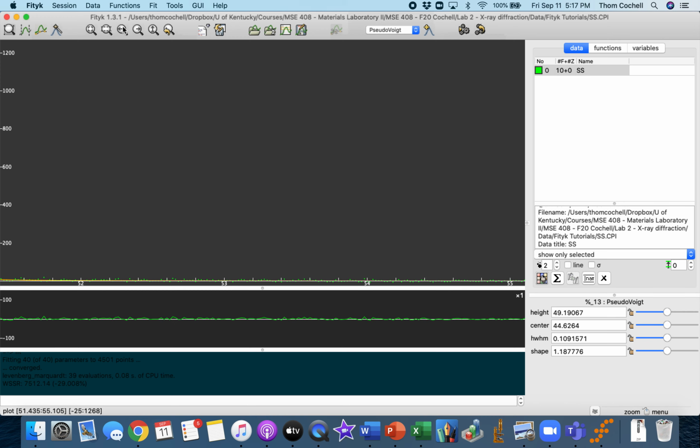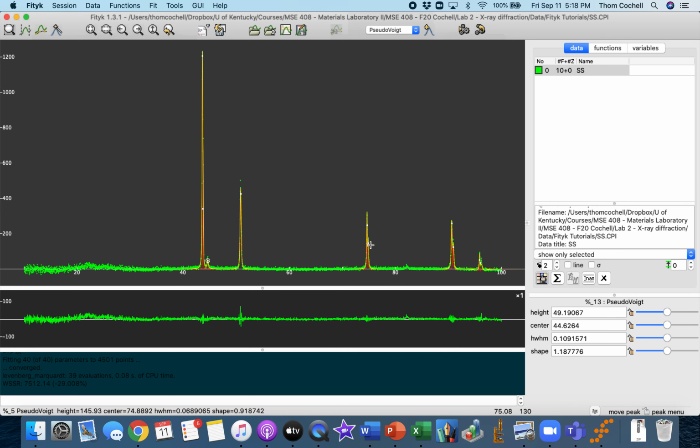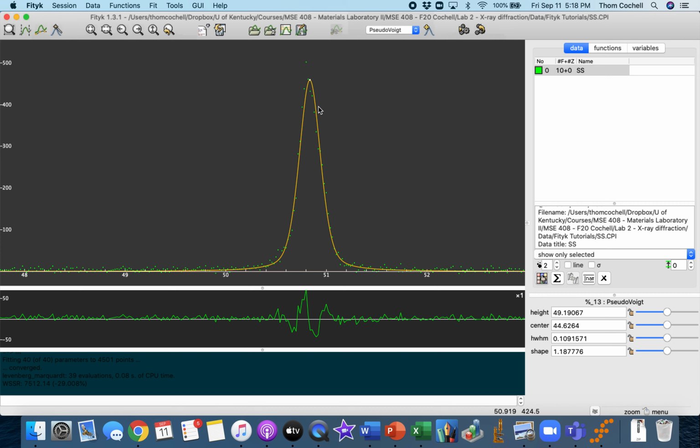One thing you'll notice in X-ray diffraction is when we have examples of peaks really close together like this, and it happens in each set, right? You saw that here we had two, here we had two, here we had two, here we had two. If we have that kind of two peaks together, this is an example of peak splitting. And if that happens everywhere else, it should happen here. So us not having a second peak here is probably a mistake. And so let me go in and add a second one. I'll just kind of guess it, right?